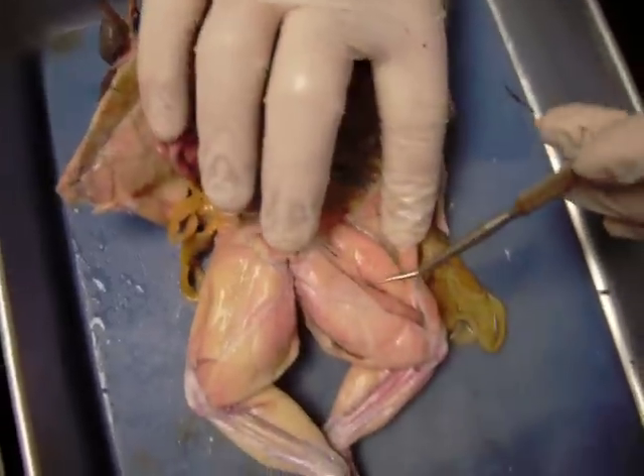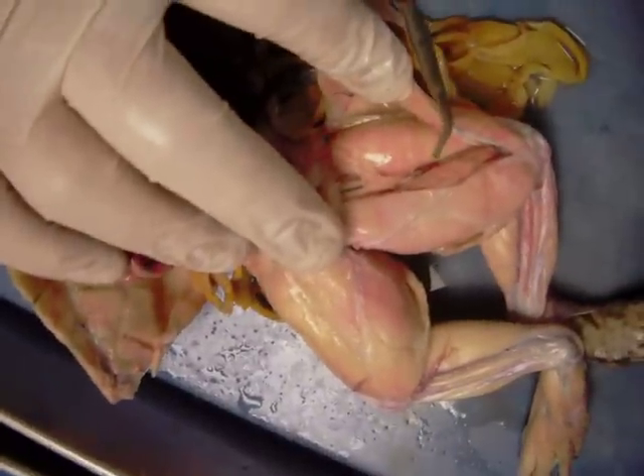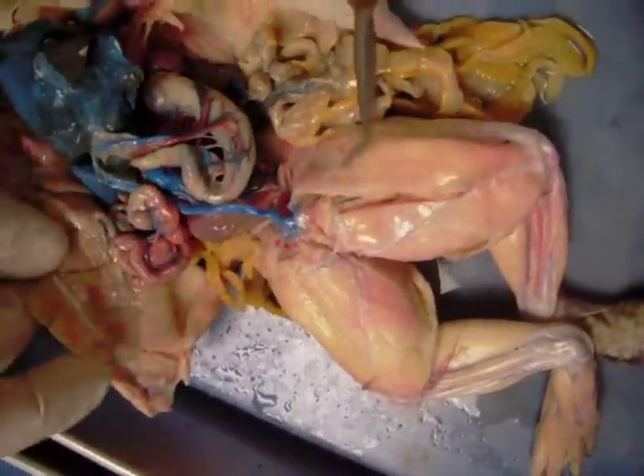Another artery we've studied on the frog is the femoral artery, and it supplies some of the leg muscles with the vital oxygen they need to do what they need to do to get the frog out of trouble.